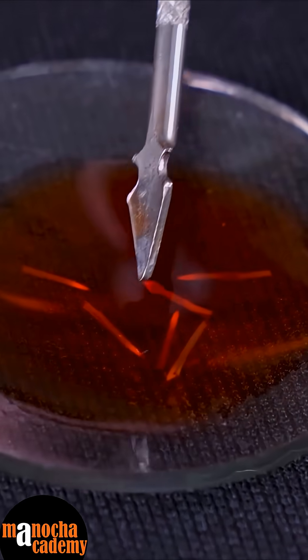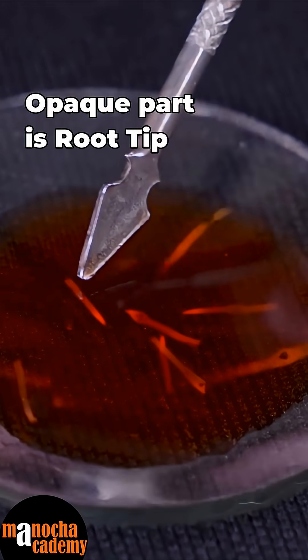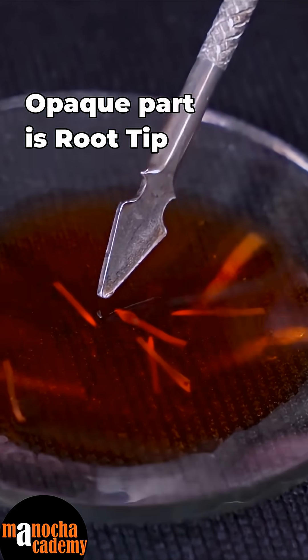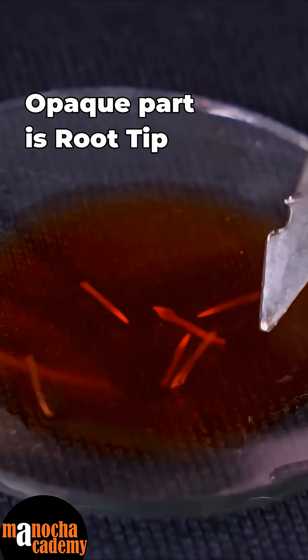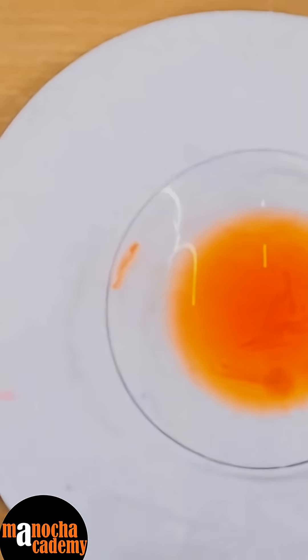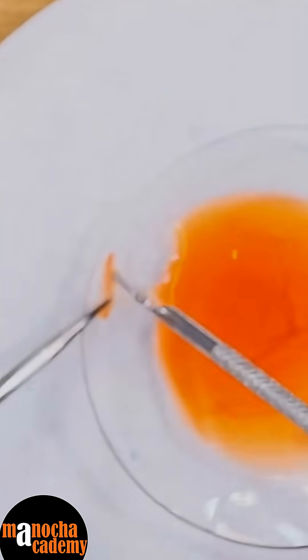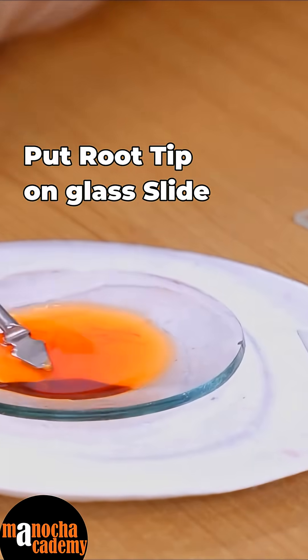If you look at these, you will see that one portion is slightly opaque whereas the other portion is transparent. The opaque portion is the tip — that is the one that you would like to keep on your slide. The transparent part you can chop off. Now we will be picking up the root tip and mounting it on the slide. You can just take the tip and discard the rest of the root — that part is the tip, and I will discard the rest of the root.